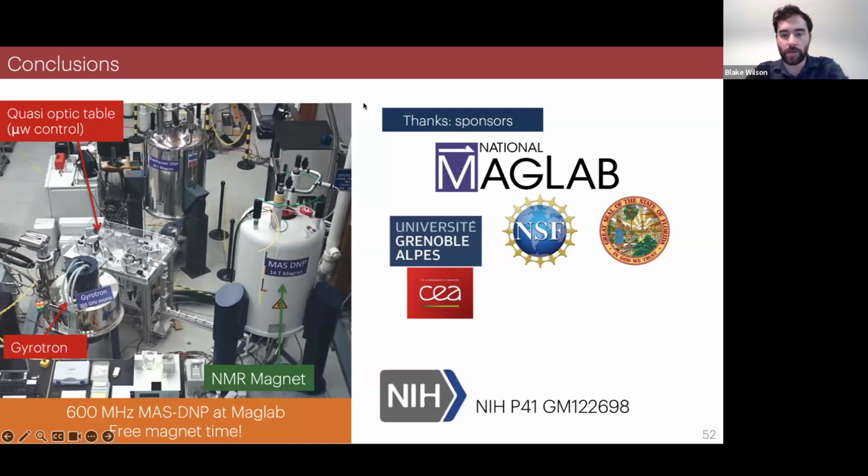Great. So I have a question about spinning. Does the spinning speed affect the accuracy of the calculations if you're looking at very fast or very slow spinning? I don't know. I answer bluntly. I don't know. For everything I can access, it's up to 12 kilohertz so far. I will have a probe that spins faster, and in a few months I will be able to tell you if it's messed up or not.